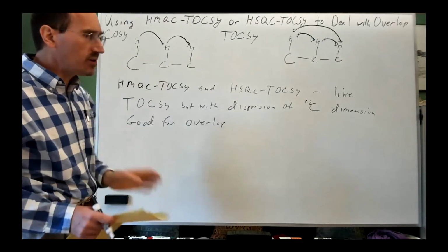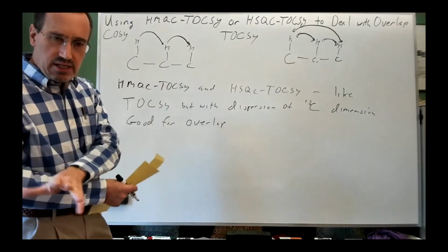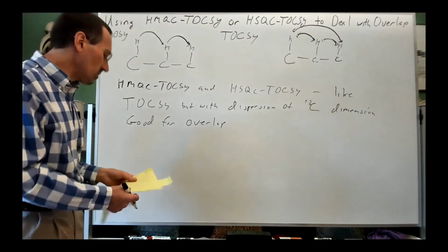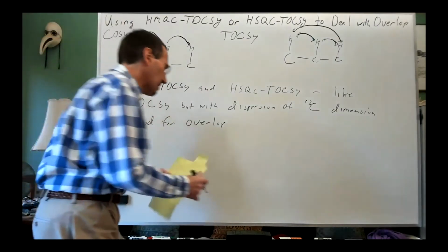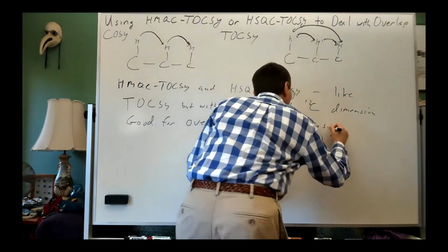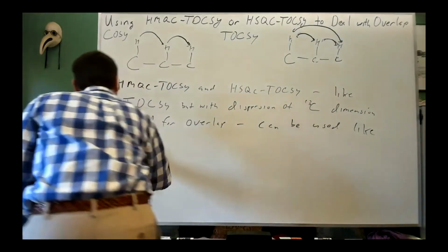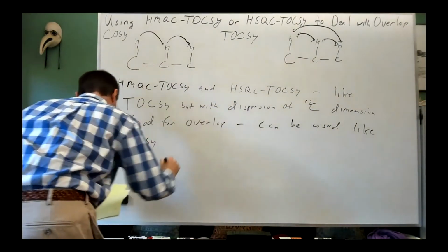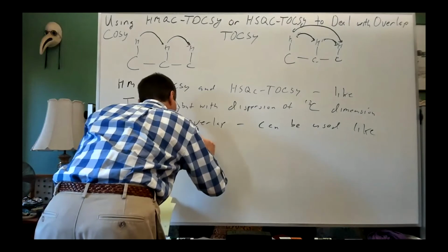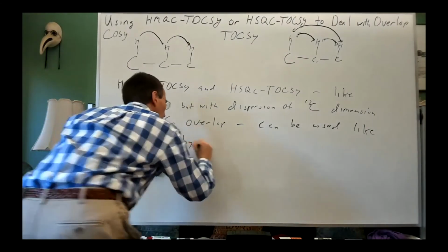And so if we vary the time scale of mixing from a few milliseconds to tens of milliseconds, we can sort of walk through the spin system, say by varying the mixing time.